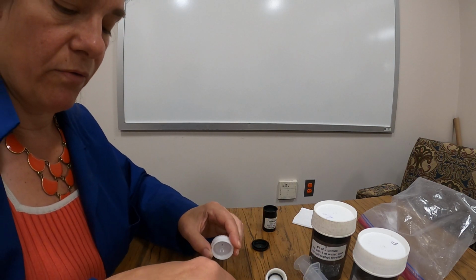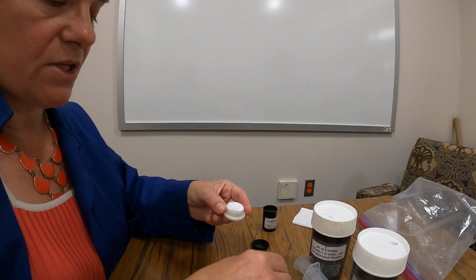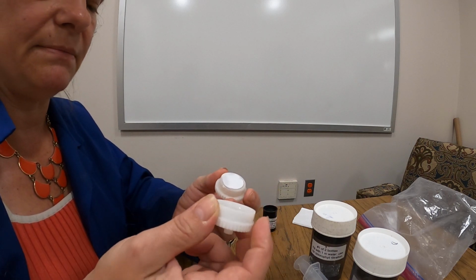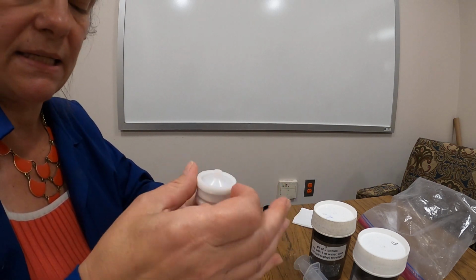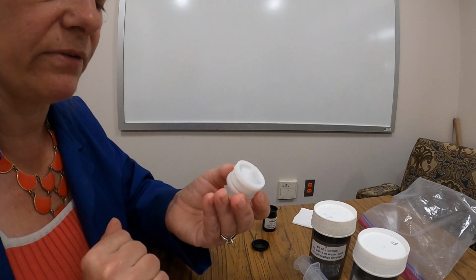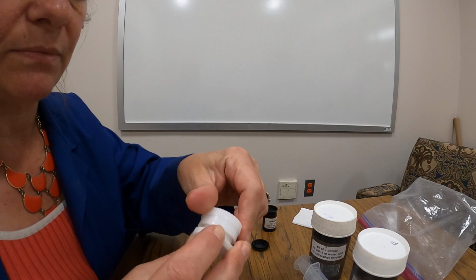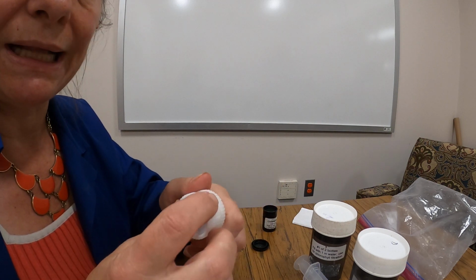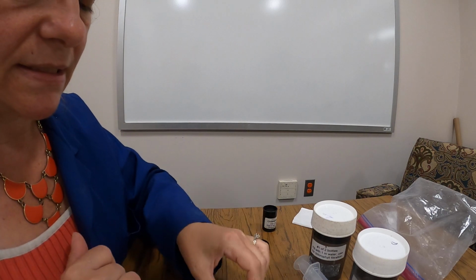I'm just going to put my O-rings. And often, if your O-ring is stuck to the lid because of the water, you can just go ahead and put that in place. It stays right in place, and when you screw it down, it will put the O-ring in the right position. You want to make sure that these are pretty tight. You want them to be what we call hand tight. So you don't want to crank it down so much that you're going to have trouble undoing it, but you do want it to be snug so that no water seeps through there.